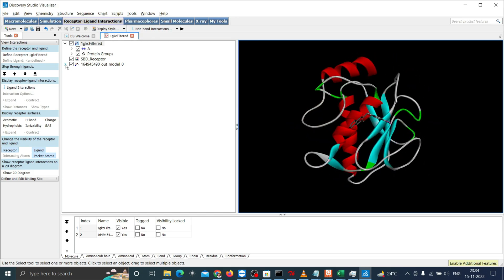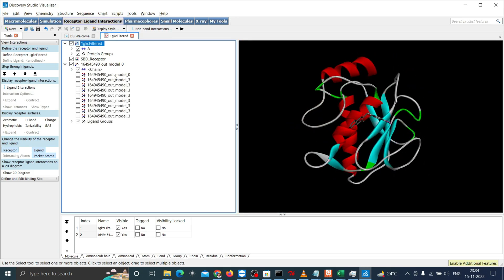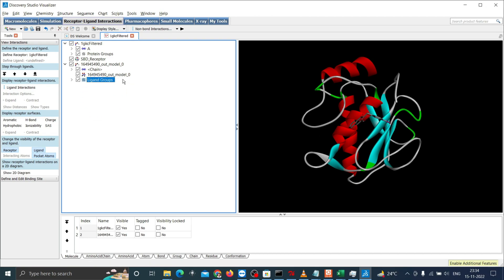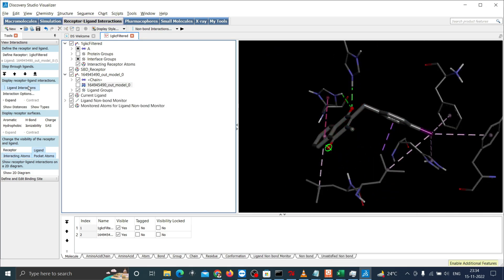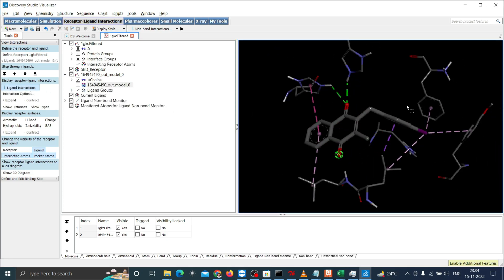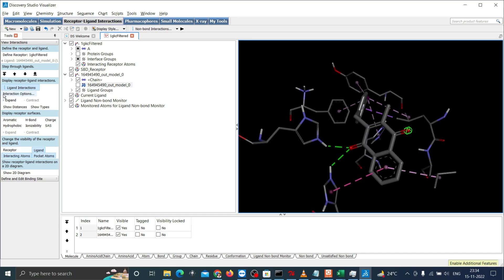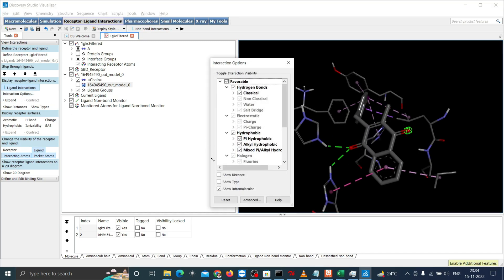Now select the first result which is the one with higher affinity score. The rest you can delete by clicking it and pressing delete button. Now click on the ligand interactions to see the interactions between protein and the compound. Go to the interactions options and untick intramolecular interaction to see specific bond between both ligand and protein.